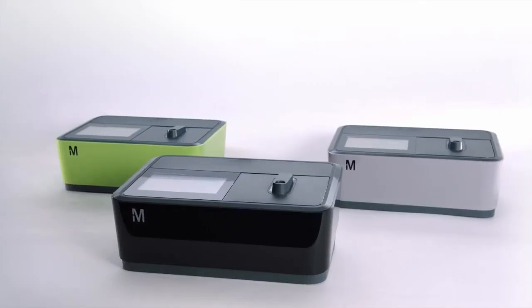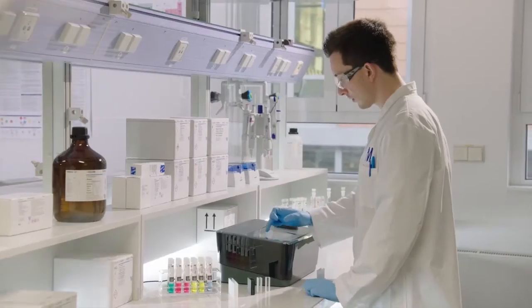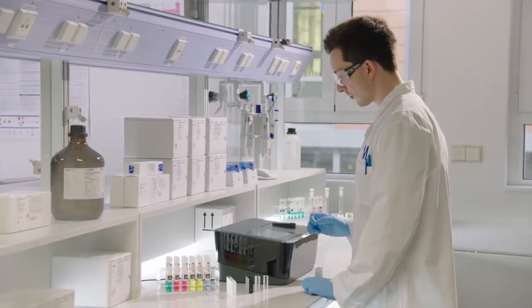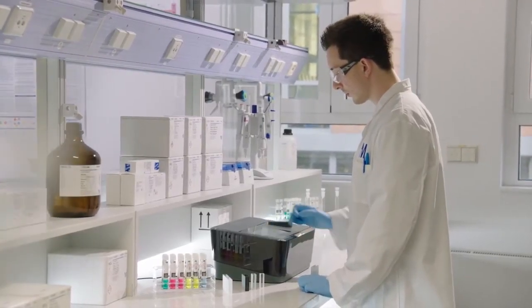The instrument supports and guides you through each test to ensure the security of your analytical results.